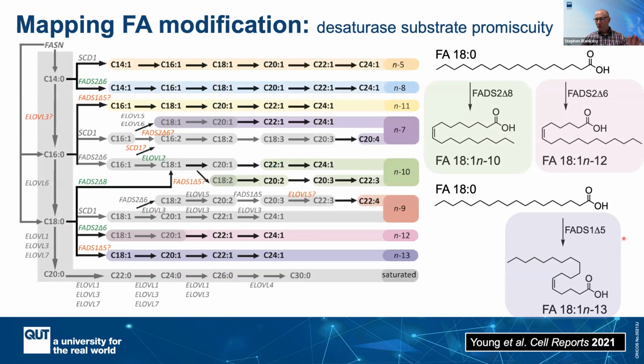So if you lay that all out, this complicated figure, what we tried to do is to say, okay, what we can see now based on this technology is that if we overlay in gray what's in the textbook more or less about the desaturation and elongation of fatty acids with what we have evidence for from fatty acids carried by the complex lipids, the cell has the machinery to generate this quite significant repertoire of isomeric forms of these lipids.